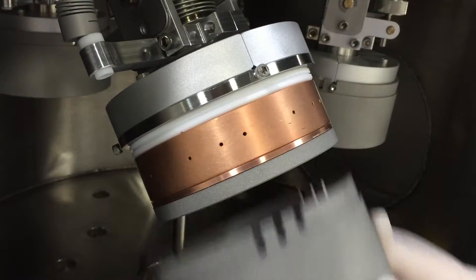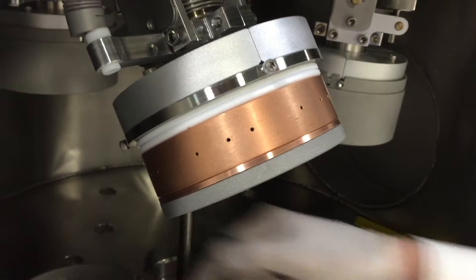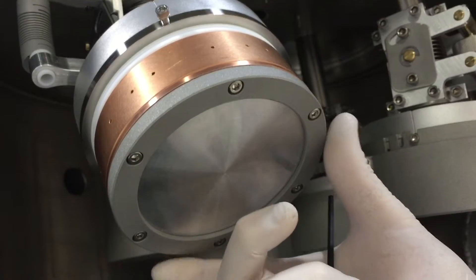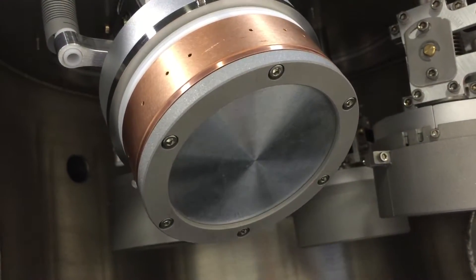Slide off the outer shroud assembly. There are six screws on the face of the target retainer that need to be removed in order to access the target.